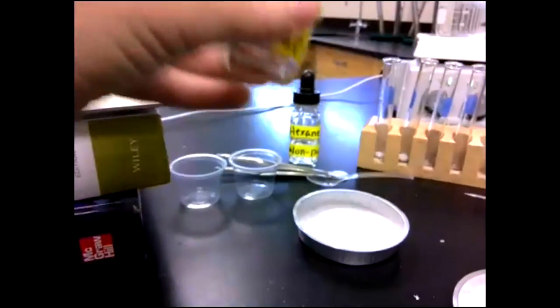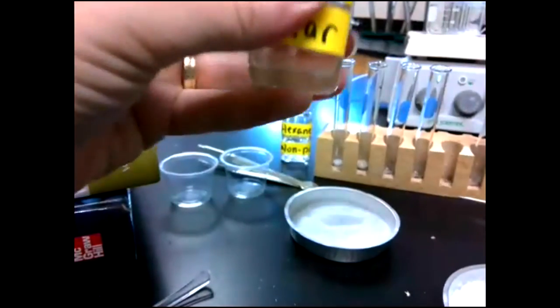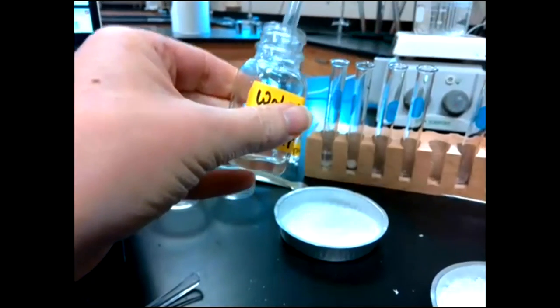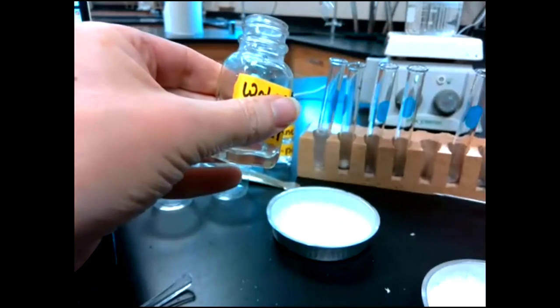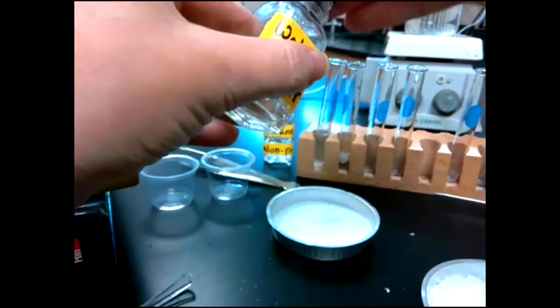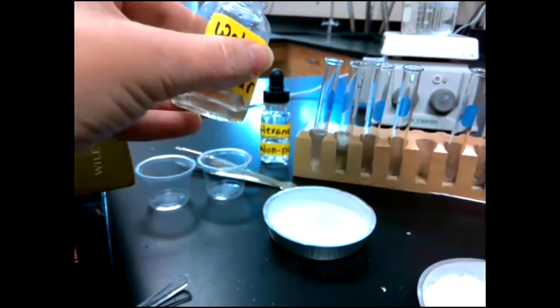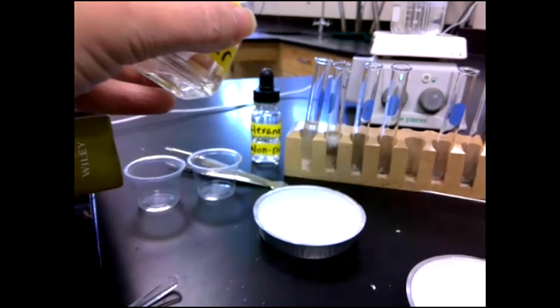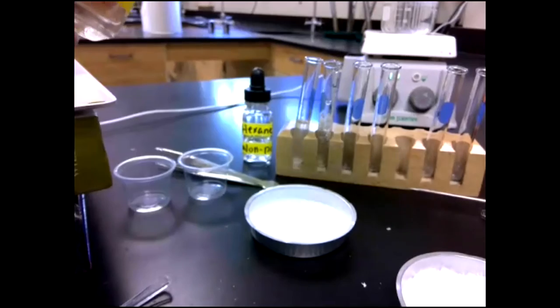So I'll put water into both of these. I have stuff everywhere here. And I'm going to fill it up about halfway with water. Each of them. One more in each. All right.